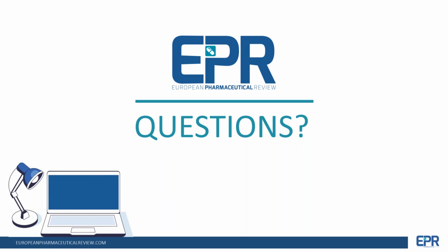Well, when we test for a customer, do we know the customer specification? Yes, we do. Well, we have to, and I must be honest, not all customers think of giving us their specifications. If we do not know the specifications, we do not know that we have an OOS, and we normally do not initiate an investigation.